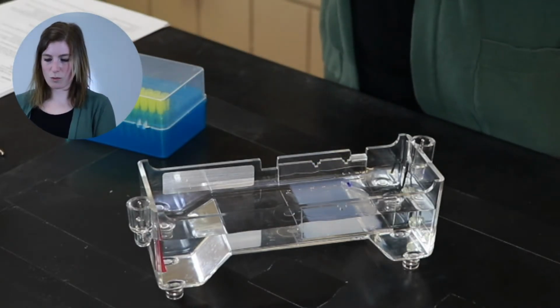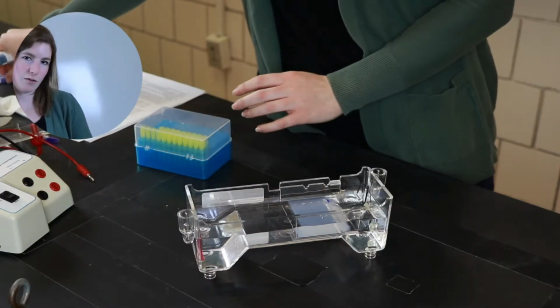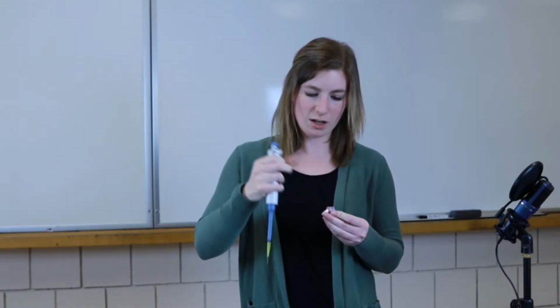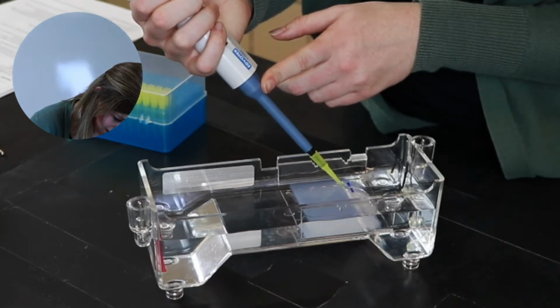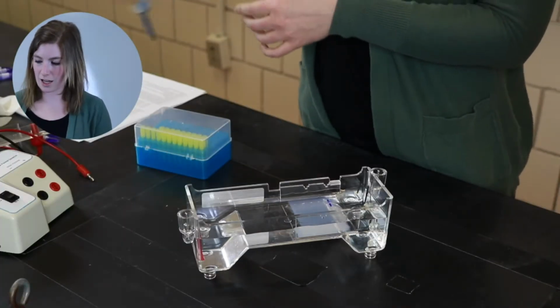So you guys will get a chance to see what this looks like once I get all of my samples loaded. But I've loaded the red sample into the first lane, and now I'm going to load the white one, which is the sample from the crime scene in this situation, into the second lane. So this lane is the one that is really important because we're going to be measuring my suspect DNA against this crime scene DNA. And the idea is that if I can match up the crime scene DNA to the suspect DNA, then that would give me a good idea that that might be the person who did the crime.